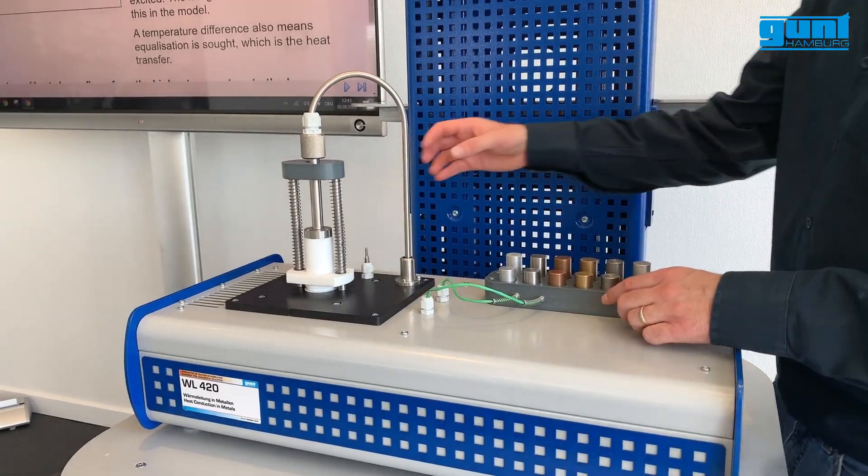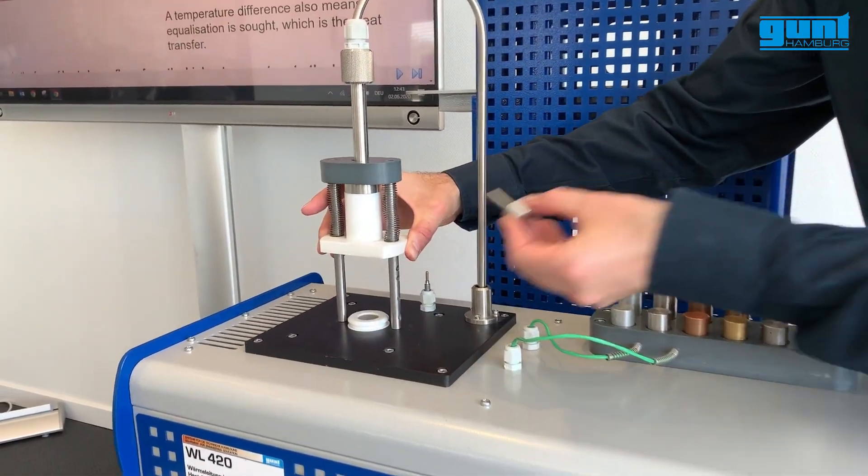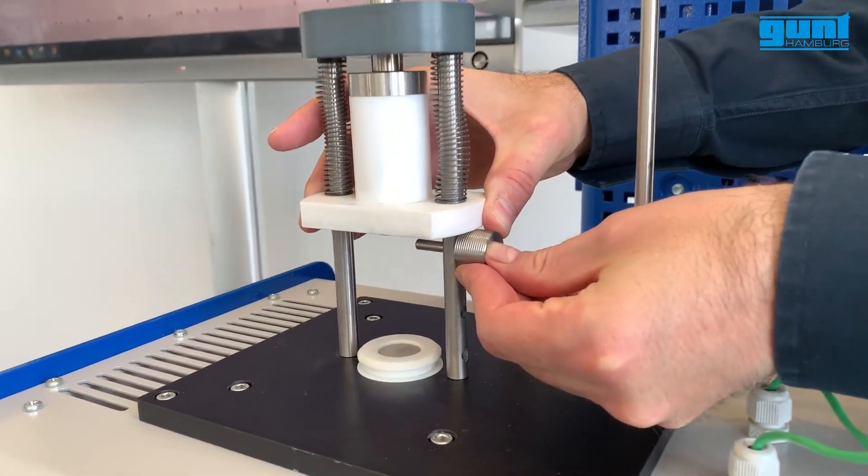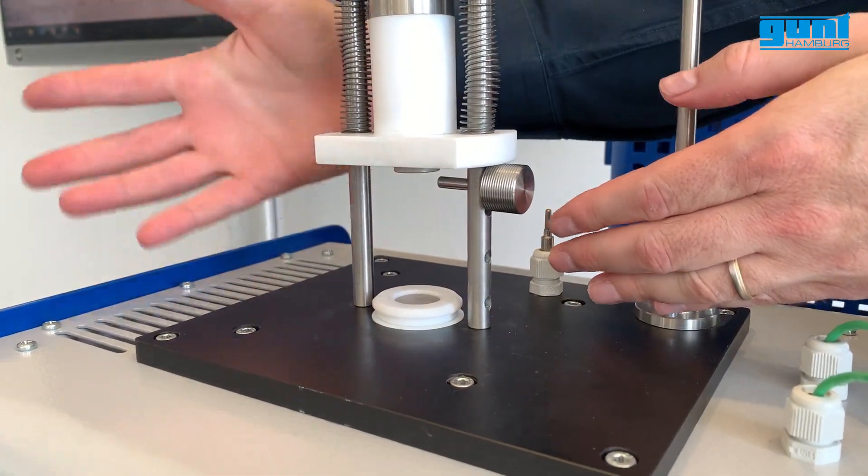For the calibration process, the spring-loaded device is locked in the upper position without a specimen. This way, all the electrical heat is dissipated via convection. When starting up the software, which is supplied with the unit and installed on any Windows-enabled device, you can select one of four languages. For the calibration process, you select calibration from the test menu.